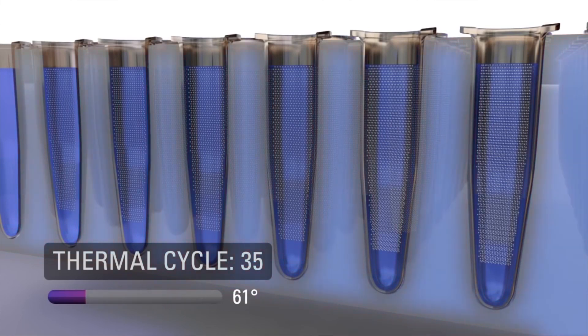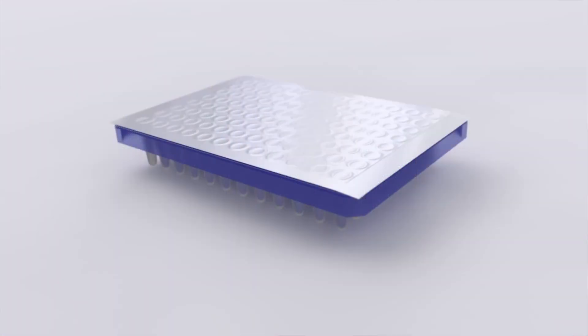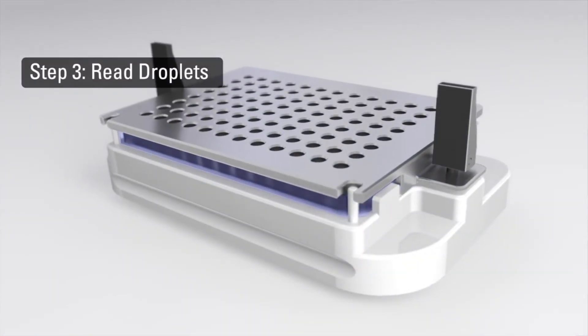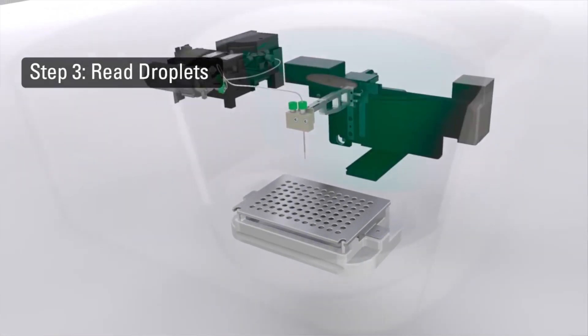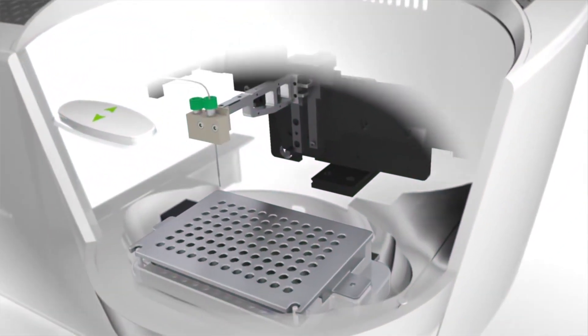In digital PCR, you actually have 20,000 droplets that you're actually looking at. The difference also in digital PCR is it actually partitions your sample in an oil-immersion droplet. And this droplet is counted, every single droplet is counted with laser, and it counts positive and negative droplets.